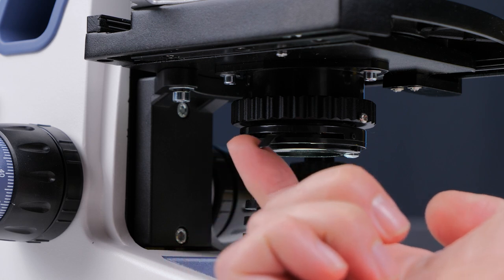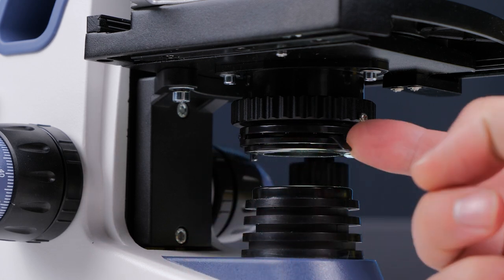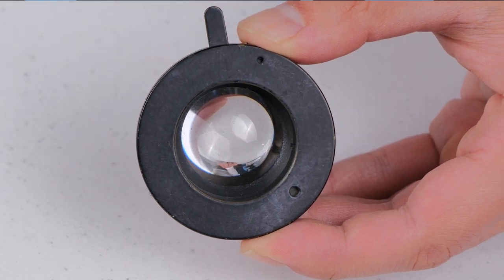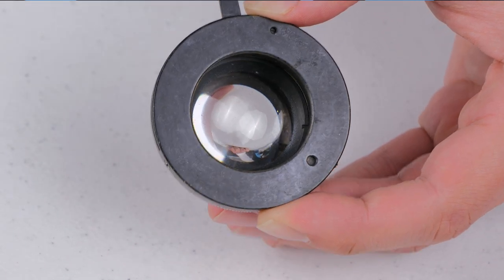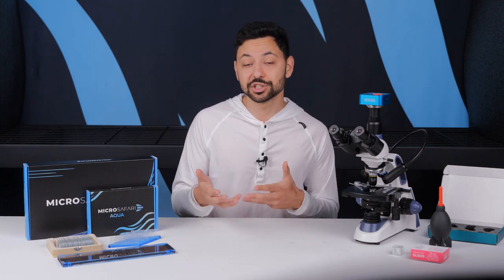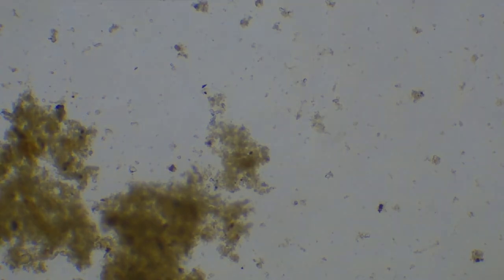Quick terminology lesson: this might be called an iris, an aperture, or a diaphragm. Each word technically means something slightly different but for now just know that they basically all mean the same thing in this context. Look through the eyepieces while adjusting this lever to see how it changes the way that the image looks.